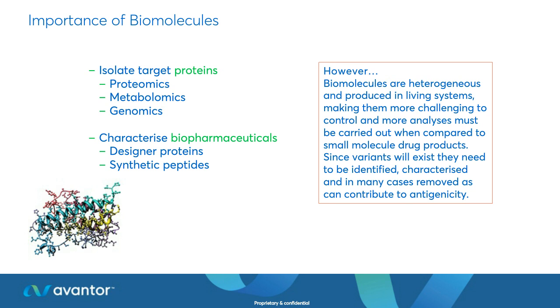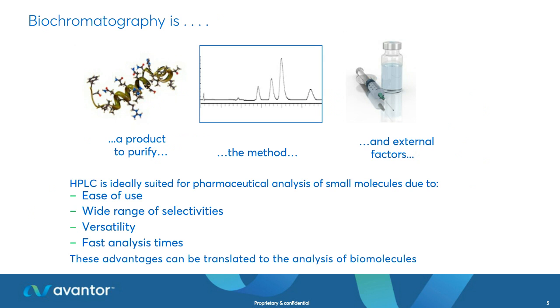Now, biochromatography is the same as small molecule chromatography. We have something we need to purify. We have our analytical method. And what you'll see is there are many different modes we could actually utilize for biomolecules. And then we have our external factors. So it's not significantly different from analyzing aspirin. It's just potentially more complex because you have such a large protein that has all these different side chains, meaning it can have lots of different functionality.